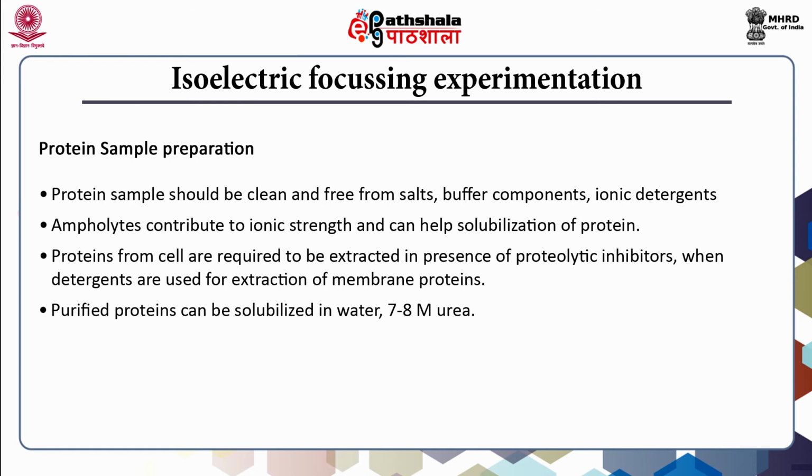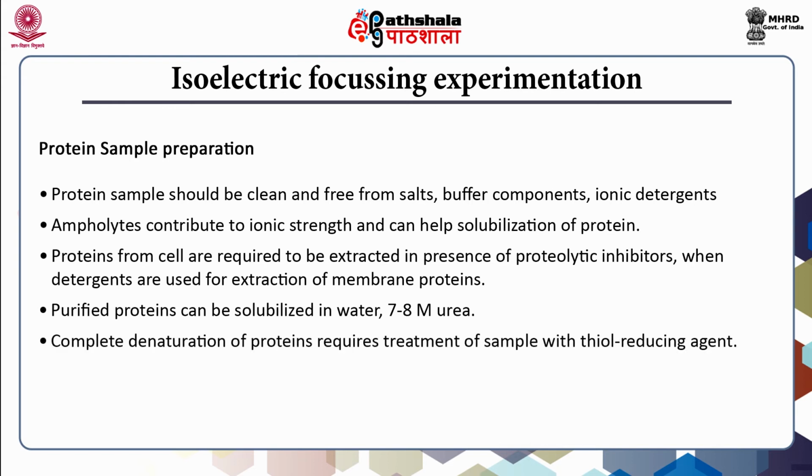Urea solution should be free from cyanate, which is present in old urea solutions. Complete denaturation of proteins requires treatment of the sample with a thiol reducing agent. Urea at this high concentration can enhance viscosity and reduce the effective size of water channels.